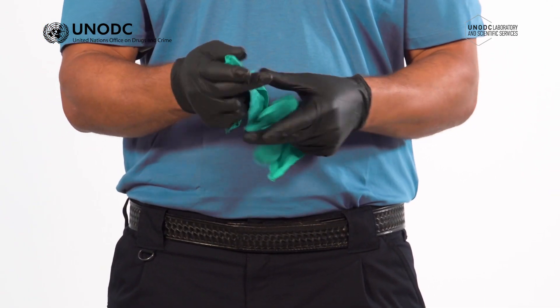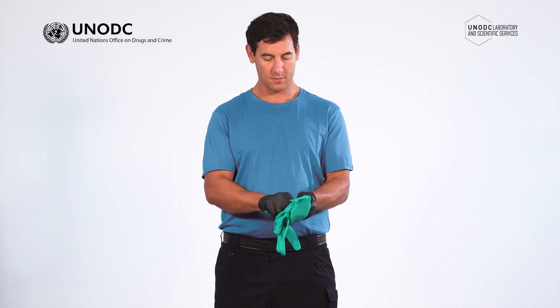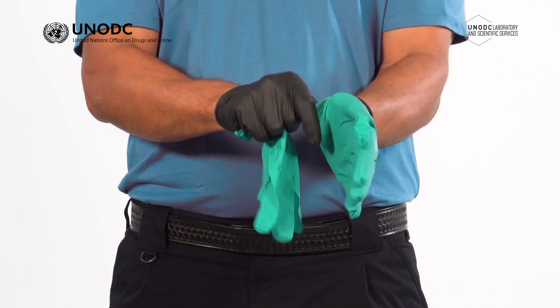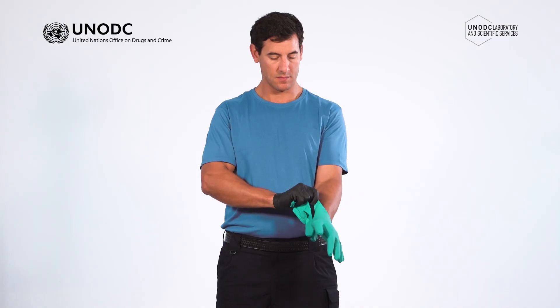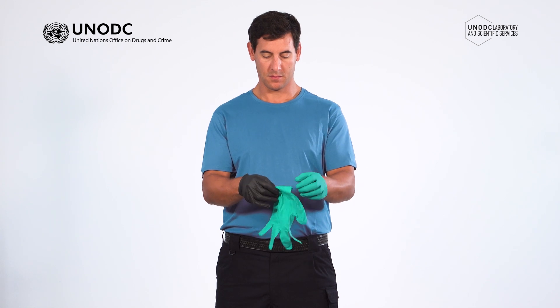Select your second pair of gloves and repeat the visual inspection. Insert one hand into the first glove and pull the cuff of the glove up to the wrist, making sure the cuff is fully extended and the wrist is covered. Repeat this for the second hand.